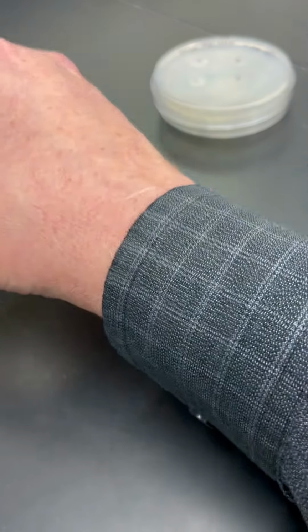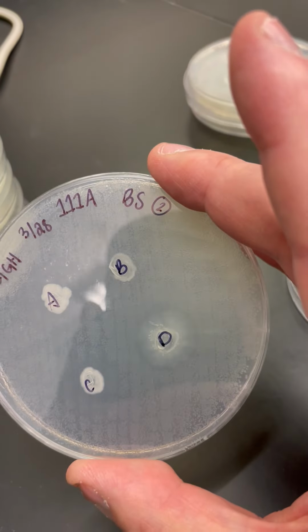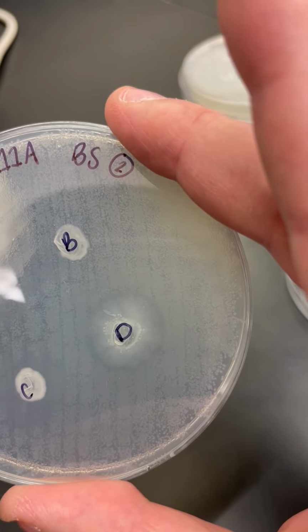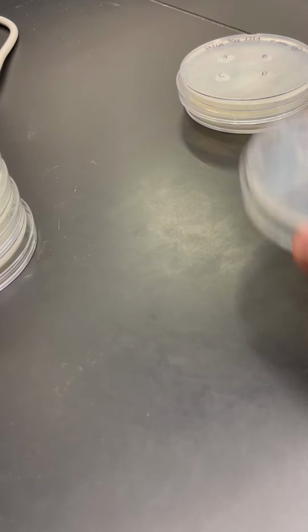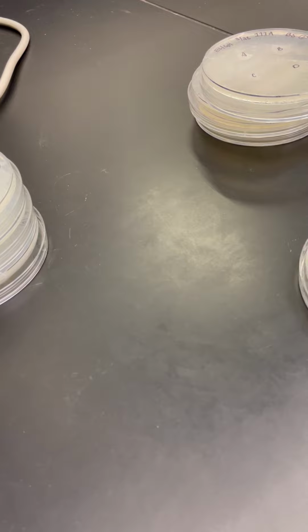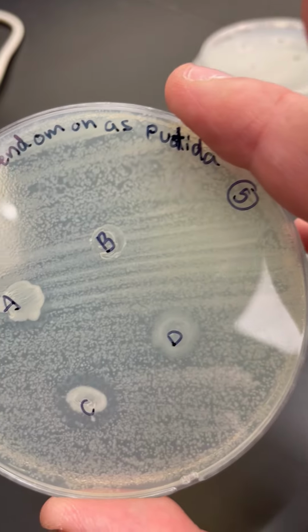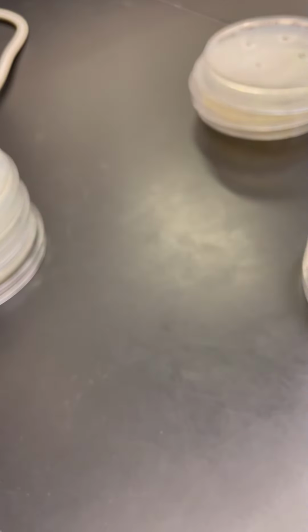Let's move on to Bacillus subtilis. And when we look at Bacillus subtilis, I would argue that C and D give zones of inhibition. Do you see them? And then we move on to Pseudomonas. Now, a lot of people didn't have anything with effects on Pseudomonas, but look at isolate C. And maybe D, but definitely C is having an effect on Pseudomonas.